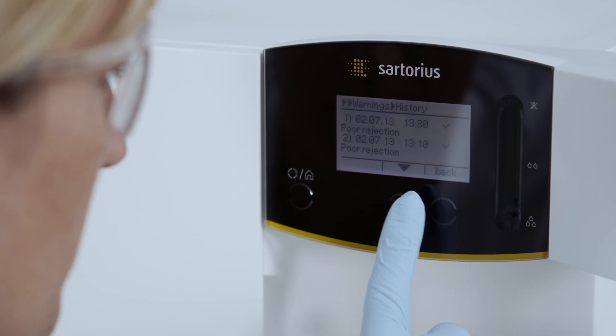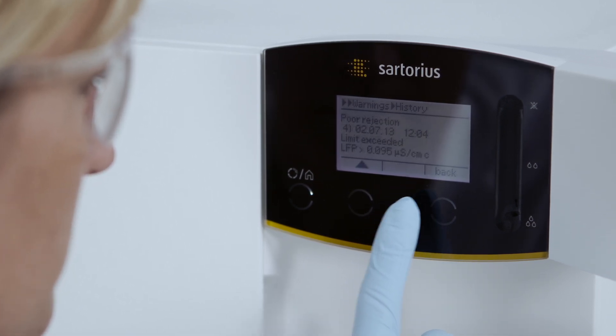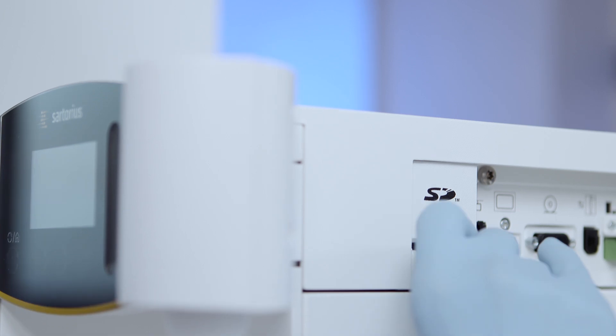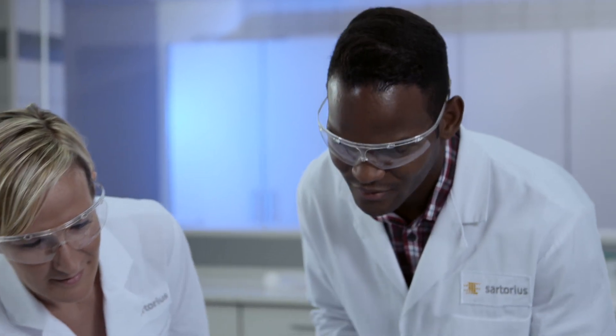The REM system saves all relevant activities and data. This information can be accessed by the user at any time, and thanks to an SD slot, be saved on an SD memory card. This ensures a valid and reliable documentation of your data.